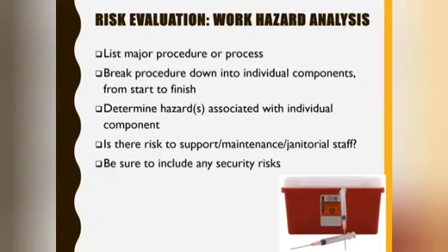Risk evaluation on the basis of the work is done by conducting a protocol-based biohazard risk assessment. List the major procedures or processes. Break down each procedure into individual components from the start to finish. Determine hazards associated with the individual components. Look for any risk to support or maintenance or janitorial staff. Make sure that all laboratory activities are listed in the protocols.